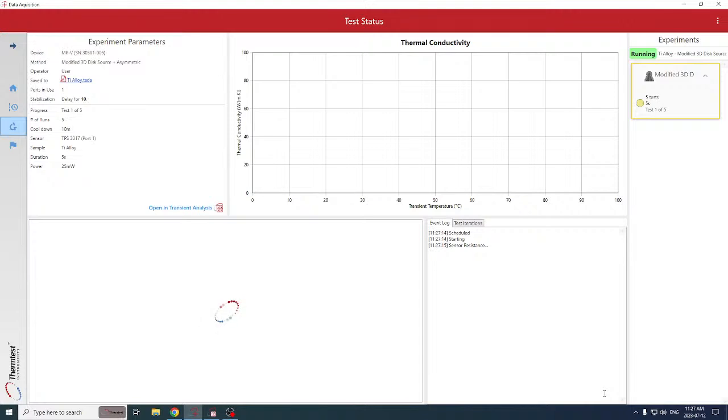So when we're scheduling measurements, it does 2 measurements in one. One is it records the temperature at the interface between the sensor and sample for stability. That's all automatic. And it's looking to see if your data is stable, isothermal. And we want to make sure that between each measurement, the heat introduced, which is only a few degrees, doesn't influence the next measurement. So that's all automatic.